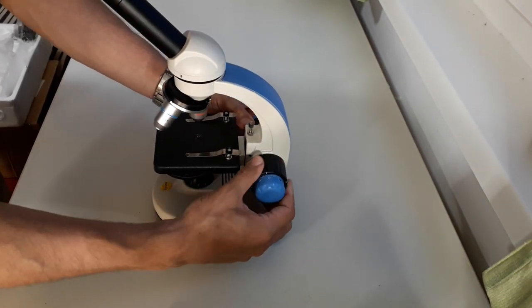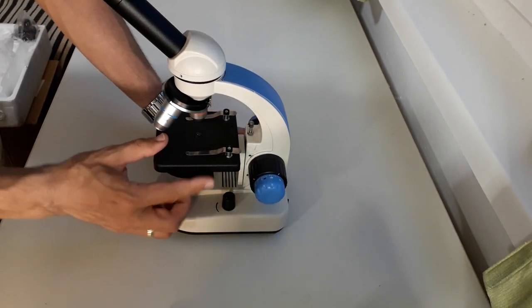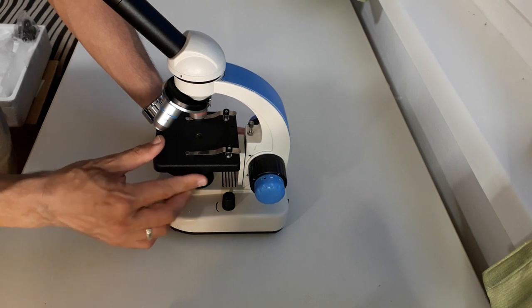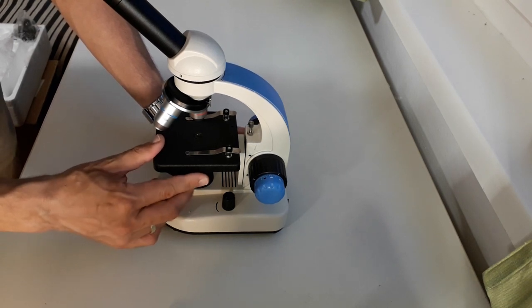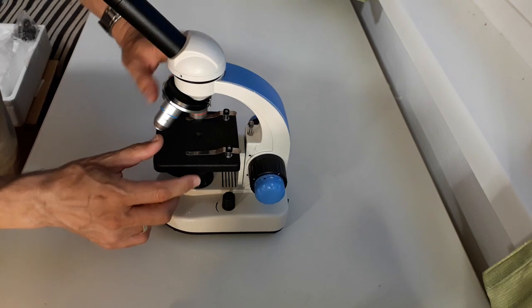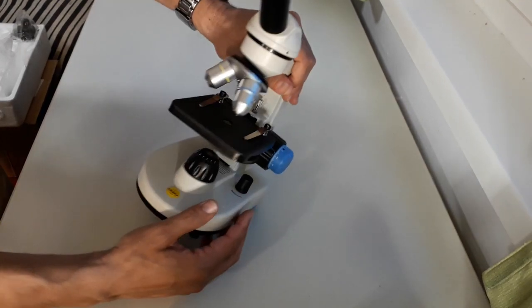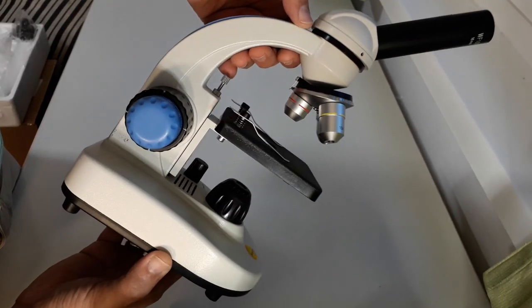And this is again the coarse and the fine focus knob that I'm now trying to test, and that also works quite smoothly. There is a little disc beneath the stage which allows you to control the aperture of the diaphragm. And this kind of replaces a little bit the condenser, because the microscope does not have a fully featured condenser. It does have a small lens in there, but a fully featured condenser for a microscope of this size would be a little bit, I would say, an overkill almost.